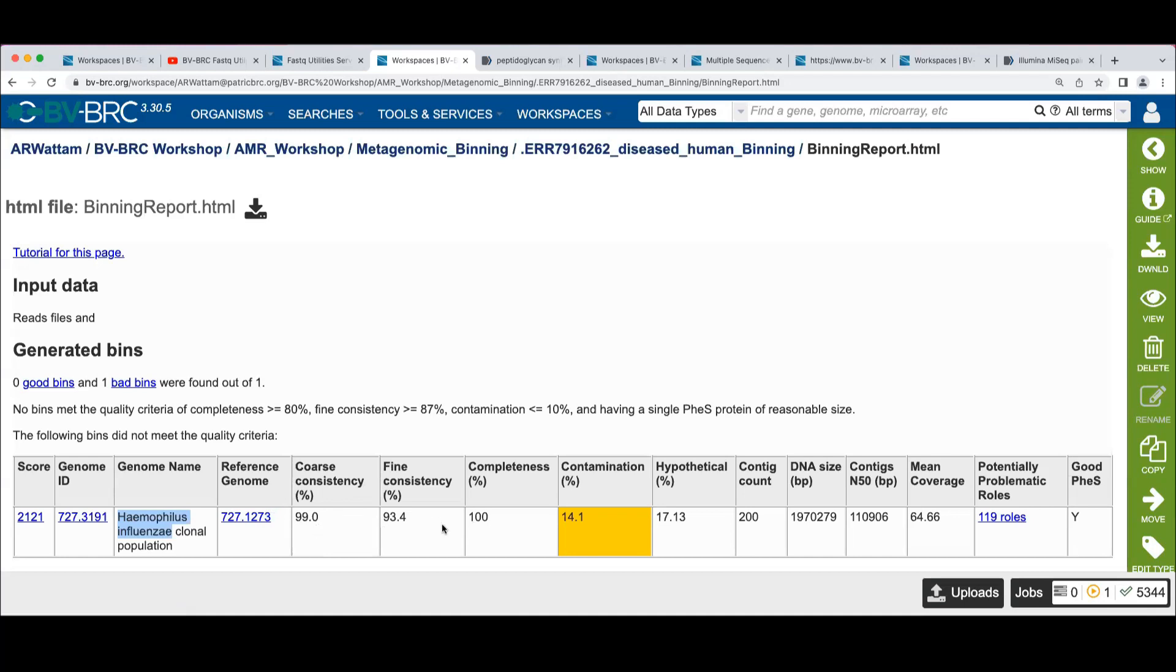It gives us the genome identifier for the reference that it used. We've got our consistency numbers, these are pretty good. Completeness is quite good. We've got 100% completeness, which means that had everything that we expected.